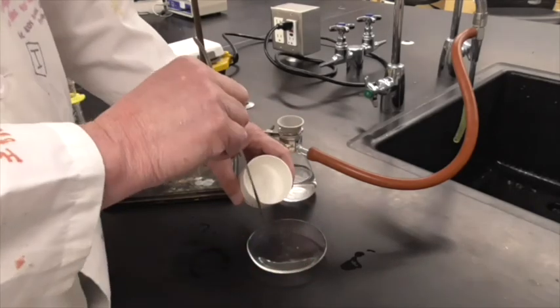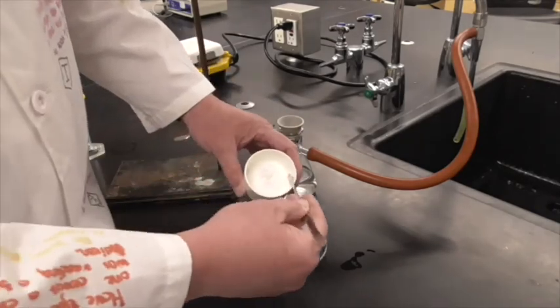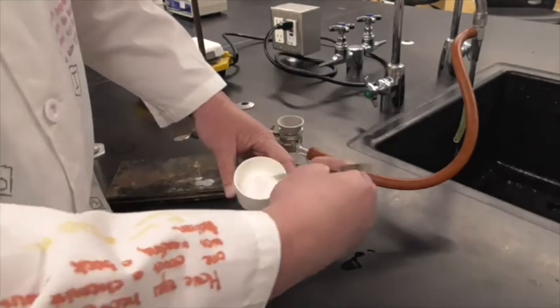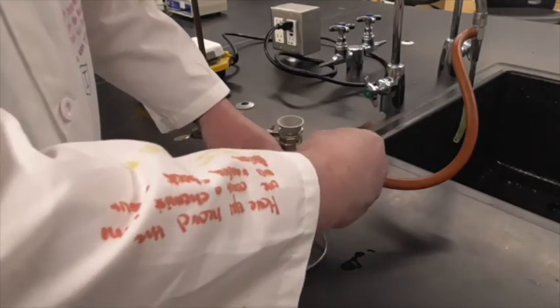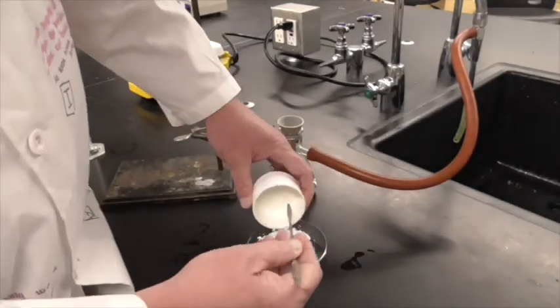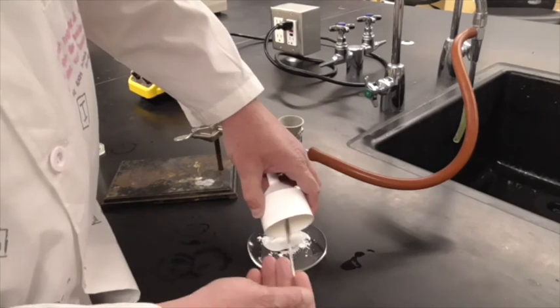I've got a spatula here. I'm just going to run around the side of the filter to try to get the filter out of there. And see, I'm just going to dump it on there. Then get all the rest of the aspirin off.